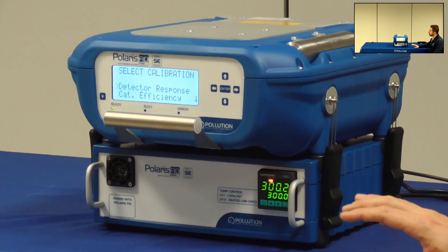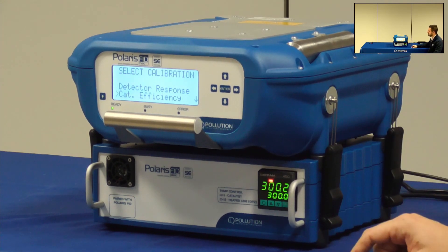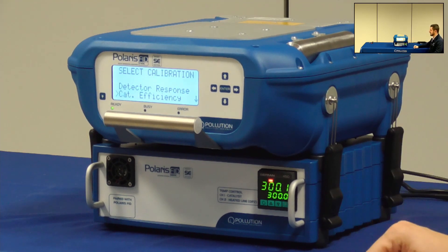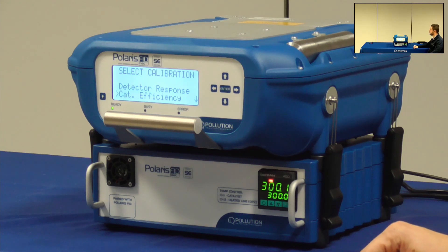It is not necessary to select cut efficiency because this is the value that is set by us during the factory calibration in order to find the best working temperature for the catalyst. So there is no need for the end user to change it.